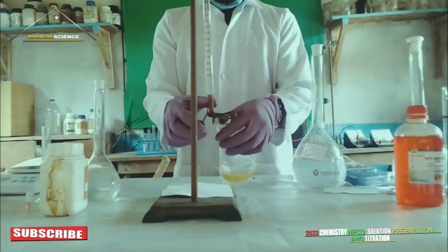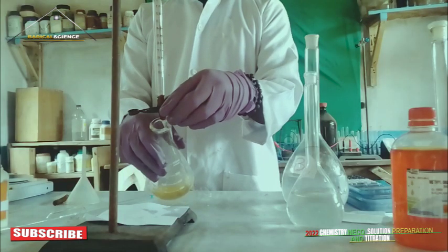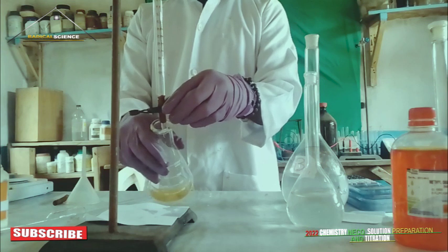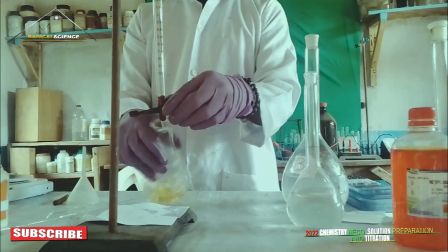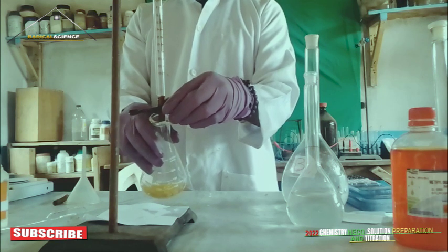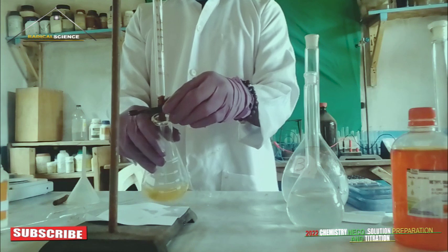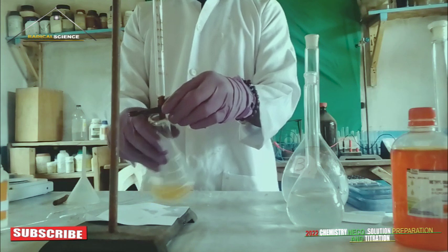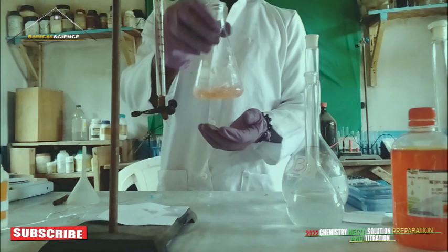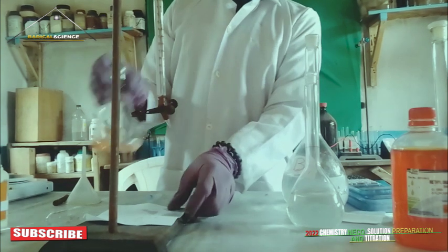Now we begin to titrate. You can see the color change.